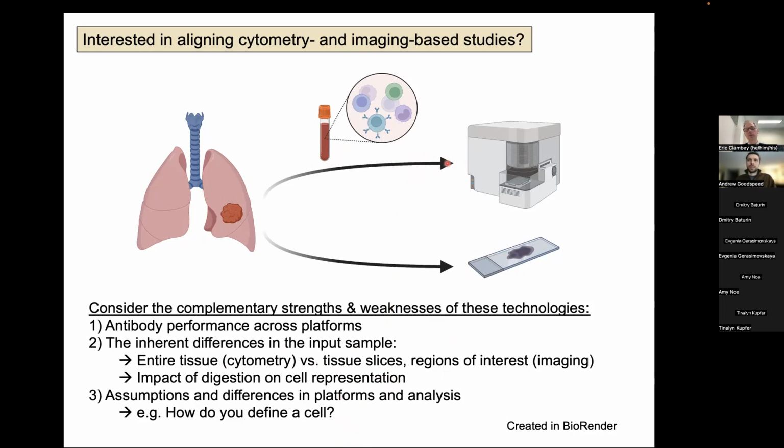And one interesting strength of cytometry is because it is a single cell suspension, you know that each event is an individual cell. In contrast with imaging technologies, you require additional things such as cell segmentation to identify individual cells, and given the close apposition of cells in situ, often you require additional algorithms to tease apart what proteins are expressed on what cells and neighboring cells.